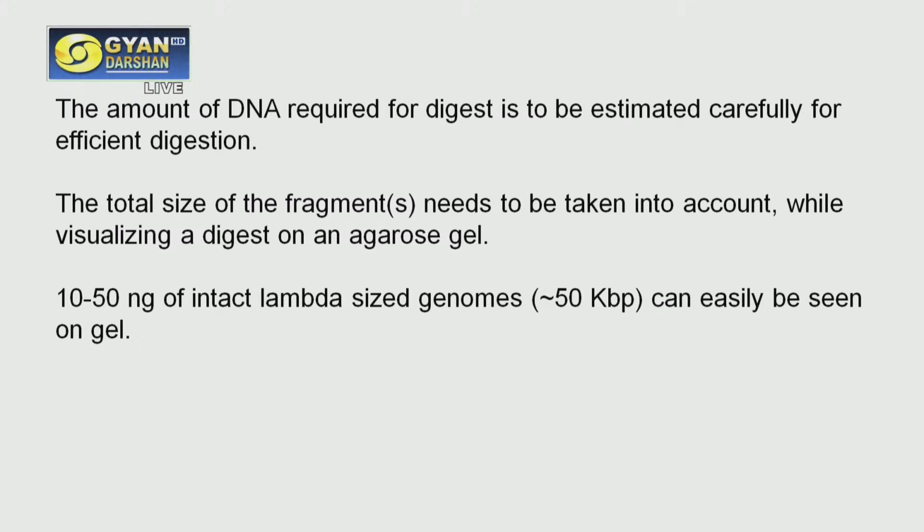Of course, you know that the plasmid has a multiple cloning site where there are several restriction enzyme sites. So you can choose any of these enzymes to cut the plasmid DNA. Again, when you cut the plasmid DNA, you can use one enzyme or you can use two enzymes also. Like if you want to cut the plasmid DNA with two enzymes, let's say BamHI, EcoRI. Or if you want to digest the plasmid with one single enzyme, maybe EcoRI or HindIII or BamHI, whatever.